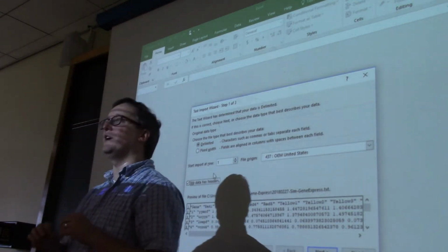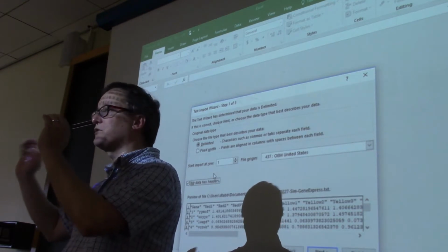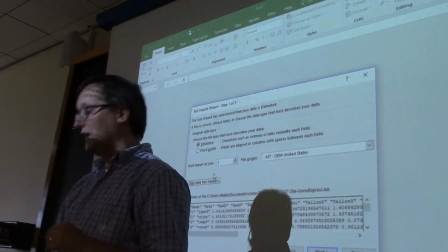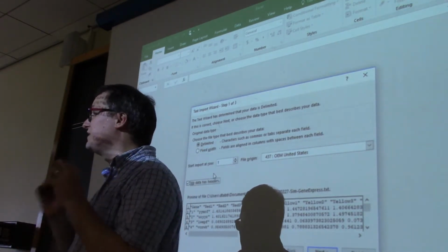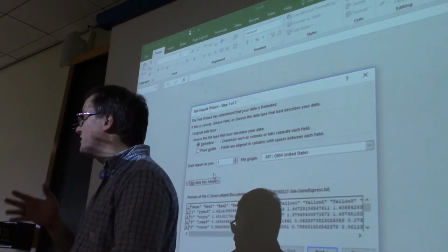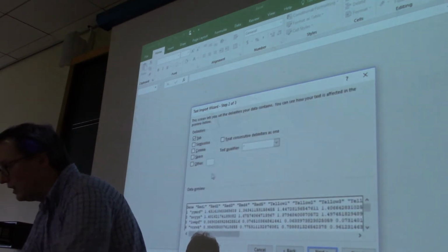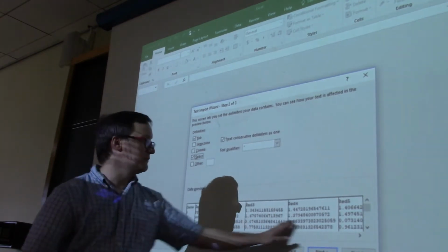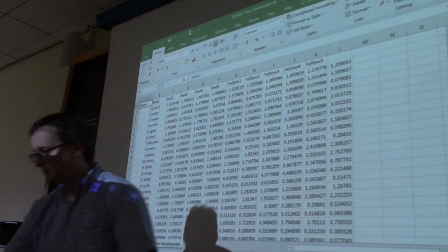If you've written a file, you might have used the first 12 characters for the first column, and then the next block of 5 characters for the next. If you've got something like that, then you have a fixed width column table. Instead, we have delimited values. Frequently, you'll see tab separated values or comma separated values. In this case, it used white space, so we have to correct that. So I'm going to just click space here, and you see when I click space, these columns down at the bottom separated out correctly. So I'm going to just say finish with that.